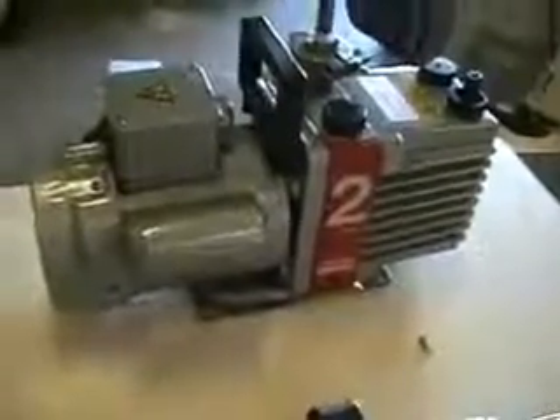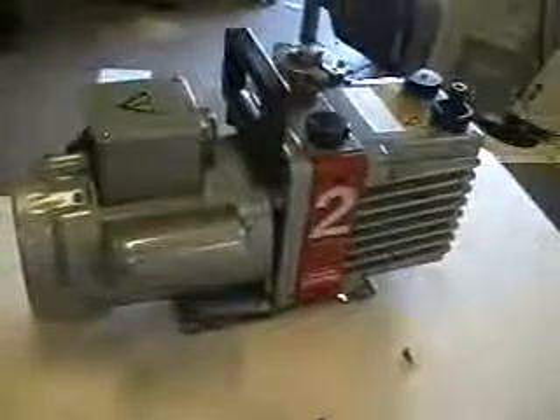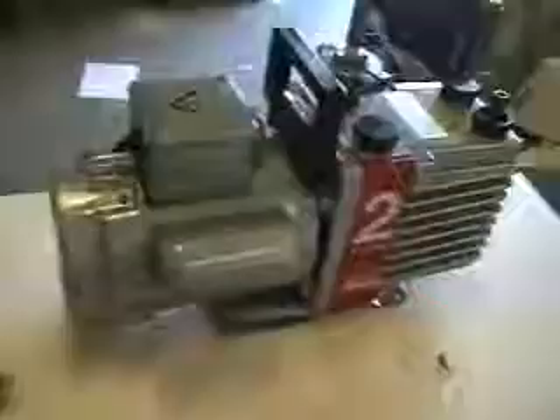This is the Edwards Model 2, two-stage, direct drive vacuum pump. The unit has been rebuilt, ready to ship out on a pallet with fresh new oil. Excellent condition.